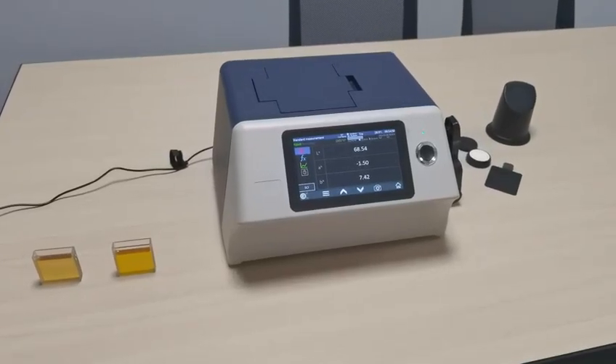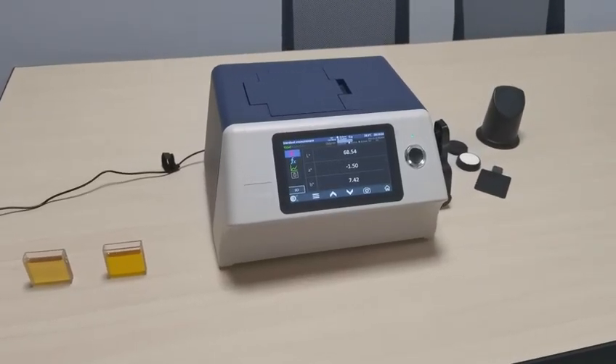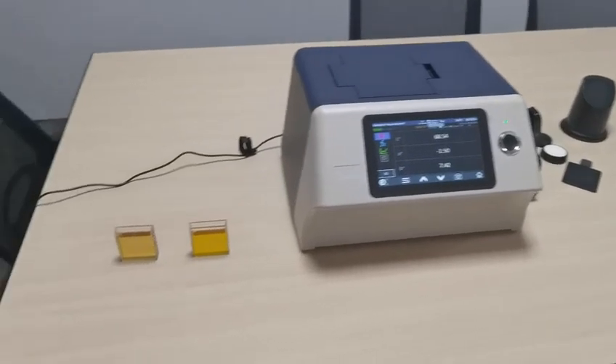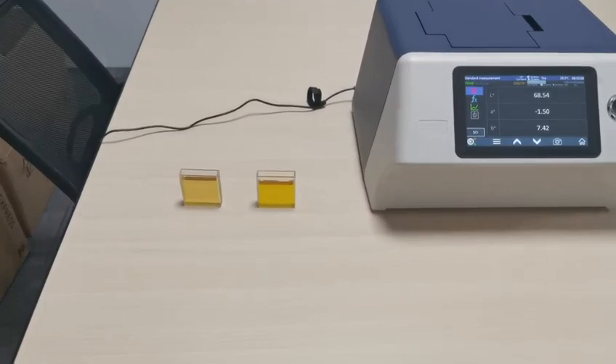This is our benchtop spectrophotometer. In this video, we will show you how to use it to test the color difference of liquid.